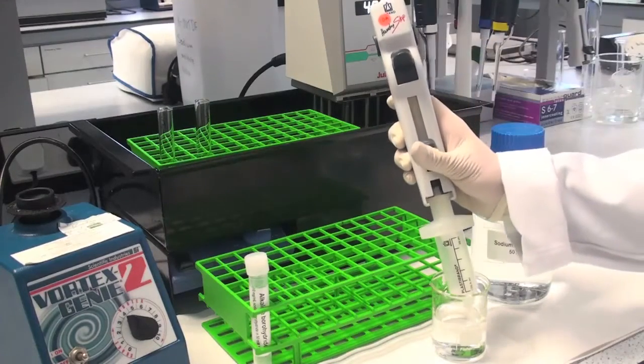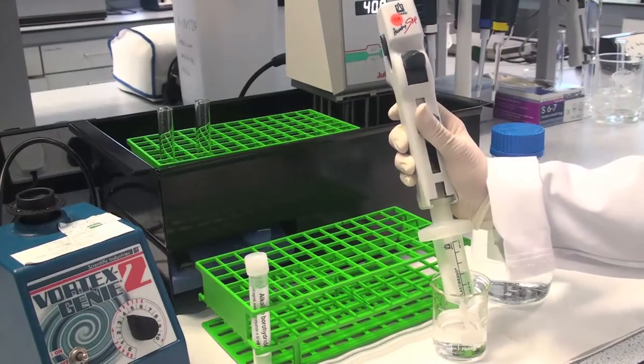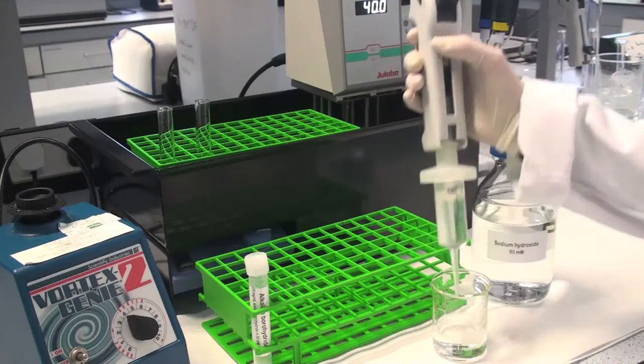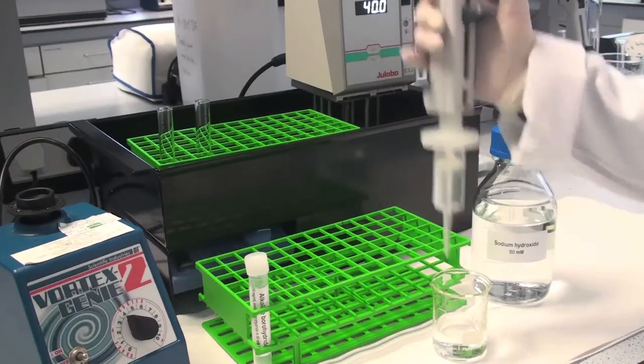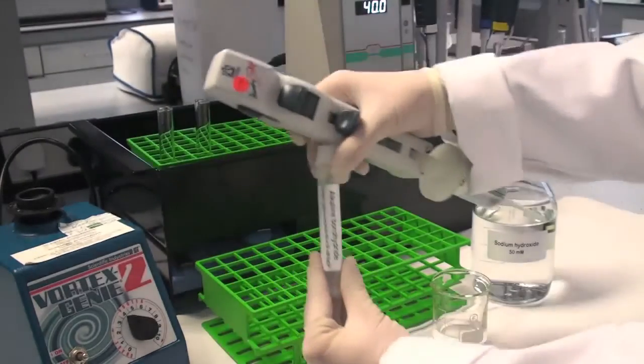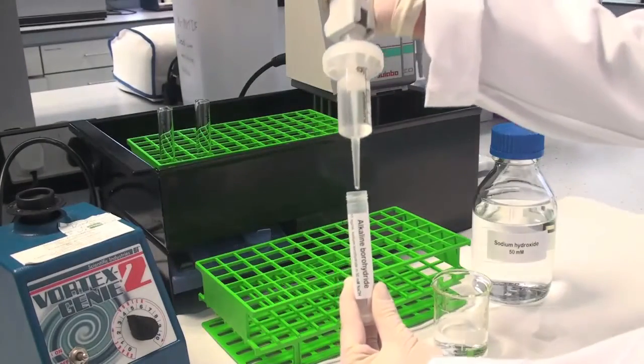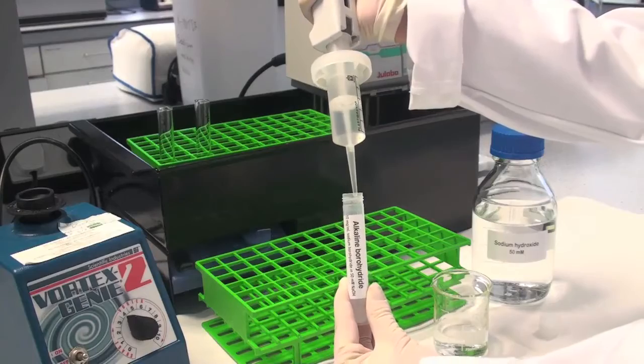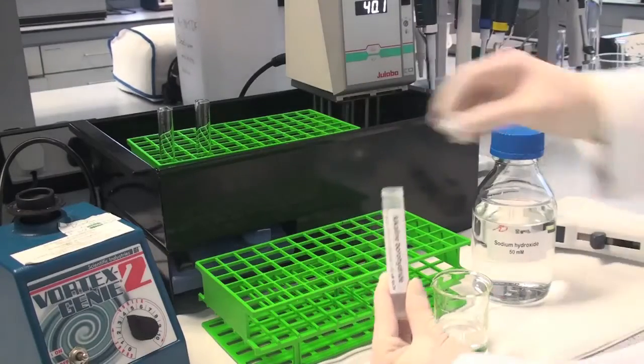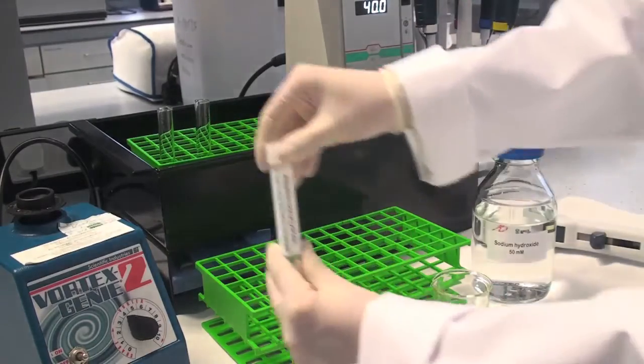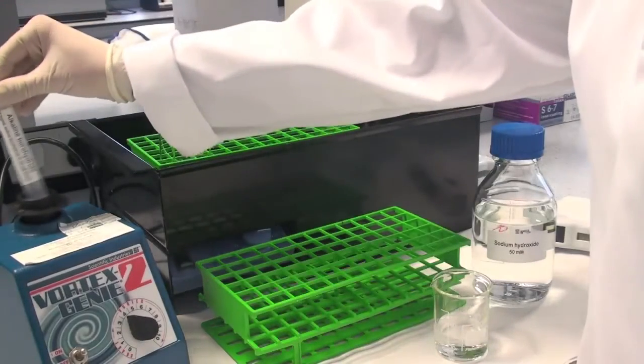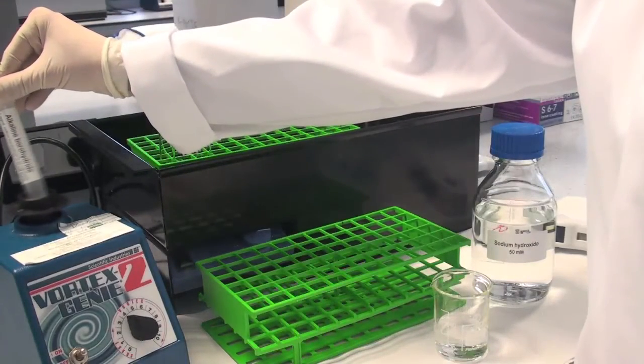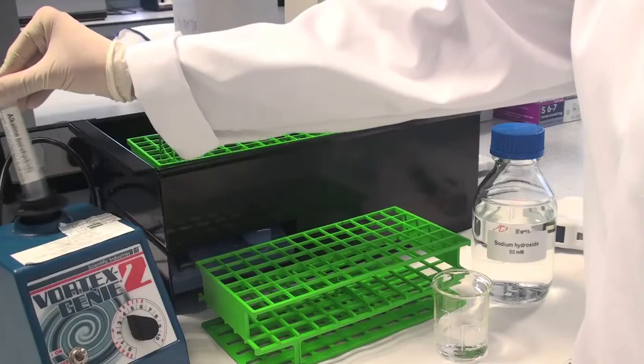Prepare alkaline borohydride solution by adding 5 ml of 50 millimolar sodium hydroxide to 50 mg of pre-weighed sodium borohydride in a polypropylene tube. Mix well. Use this solution soon after preparation.